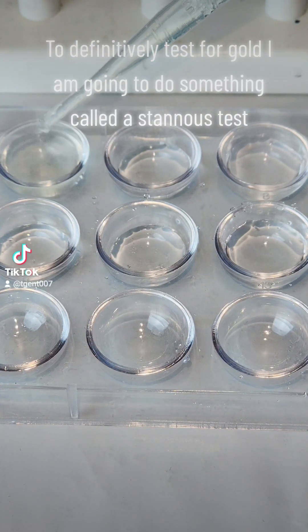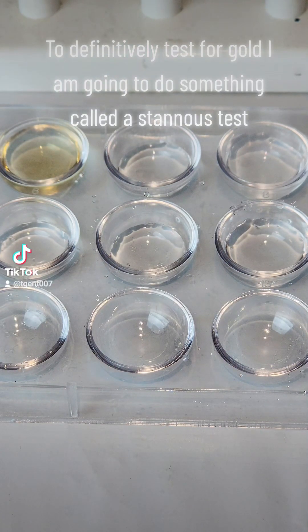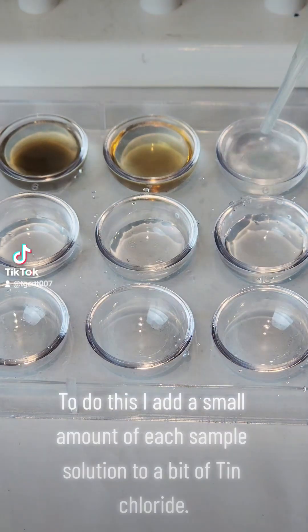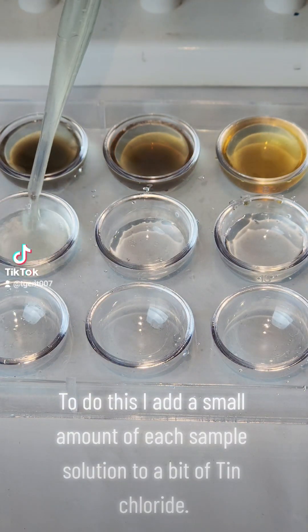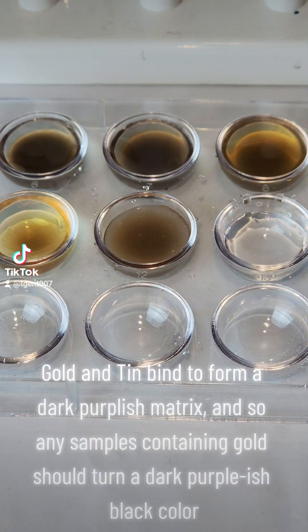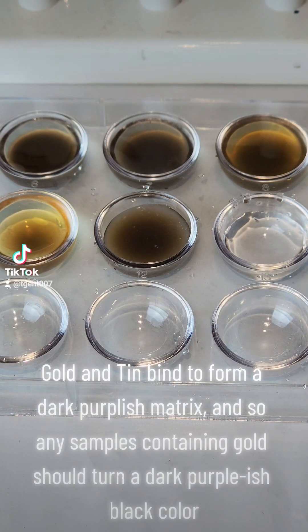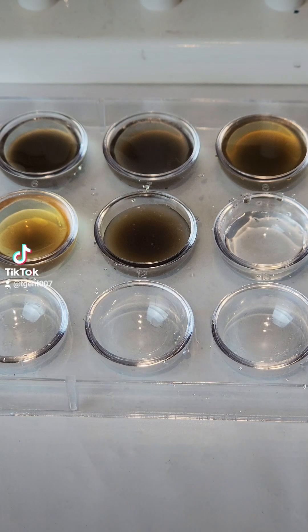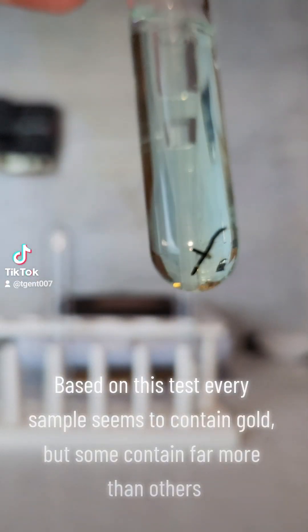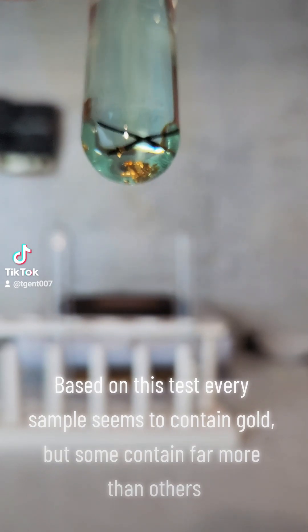To definitively test for gold, I am going to do something called a stannous test. To do this, I add a small amount of each sample solution to a bit of tin chloride. Gold and tin bind to form a dark purplish matrix, and so any samples containing gold should turn a dark purplish black color. Based on this test, every sample seems to contain gold, but some contain far more than others.